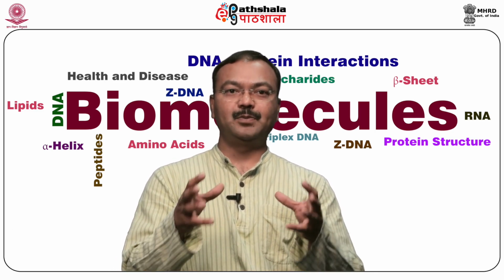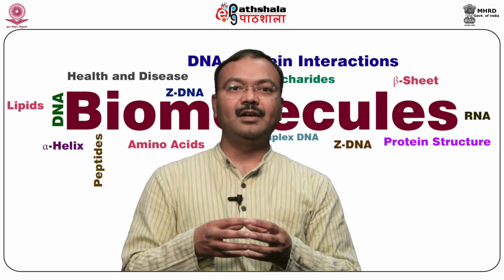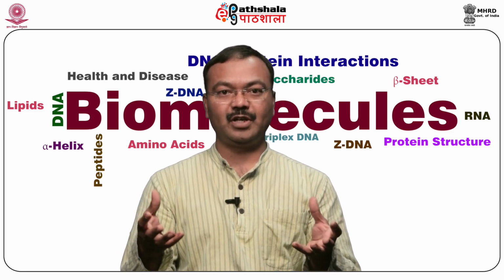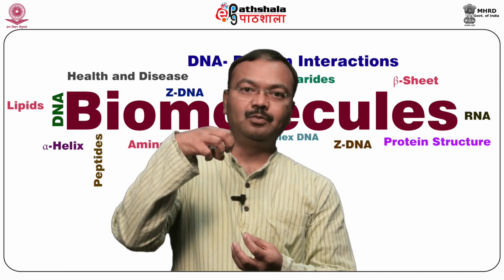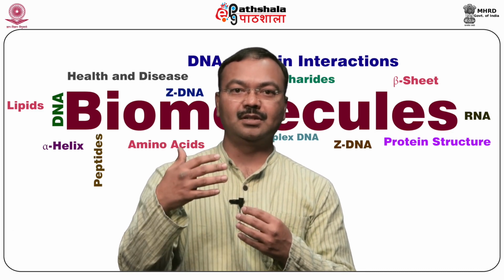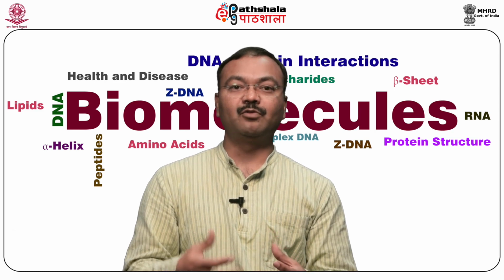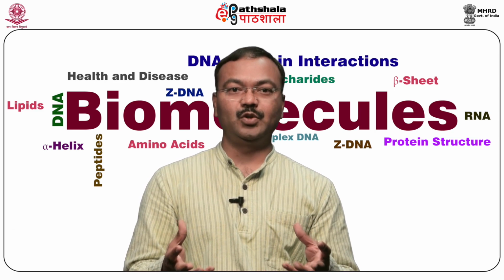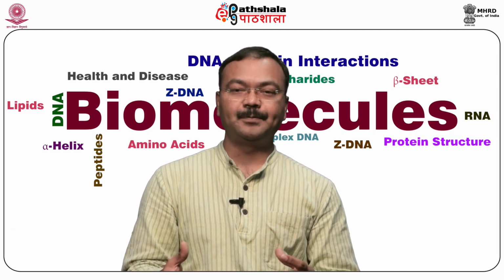There are several factors which influence the crystallization process. What kind of precipitant we are using to crystallize a protein, what concentration of precipitant, or concentration of protein, we are using. In the vapor diffusion method, the drop volume and how the drop is made, what is the ratio of protein and precipitant, what is the concentration of the well, what is the volume of the well, the ionic strength of the protein solution, the type of buffer, and different biological additives.